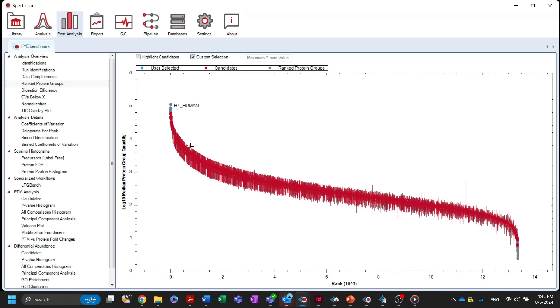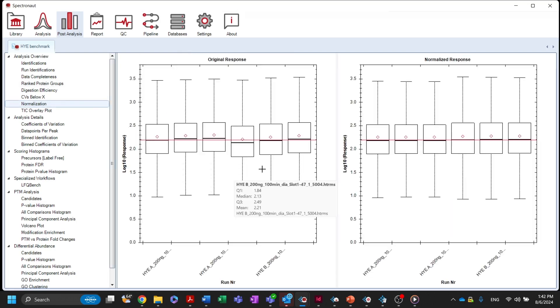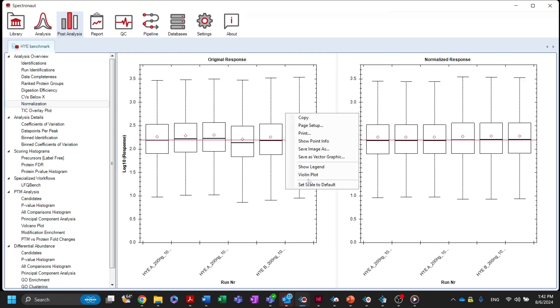The normalization node contains box plots of the response for each individual run before and after normalization. The option to display data as violin plots is accessed by right-clicking.